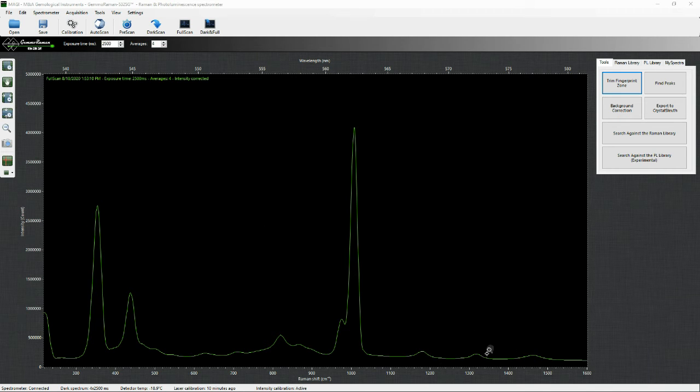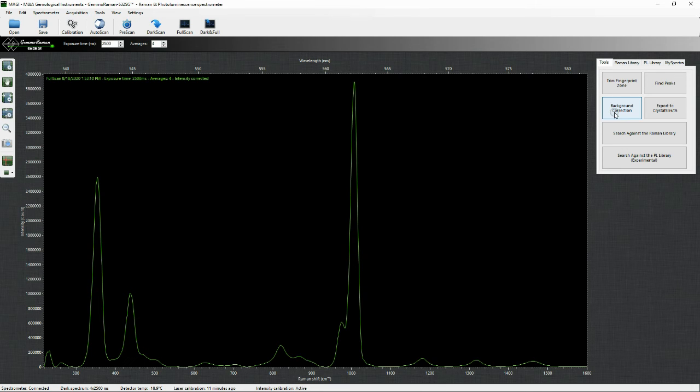Background correction. Pure Raman spectra consist of sharp peaks located on a flat baseline. In other words, the wave number locations where the material has no Raman peaks should give 0 count, complete darkness. This ideal situation is often disturbed by luminescence reactions such as fluorescence. The resulting spectrum is of mixed type, sharp Raman peaks riding on top of broader luminescence bands. The purpose of the background correction is to estimate the slope effects of luminescence and subtract them from the spectrum, leaving the Raman fingerprint as pure as possible.